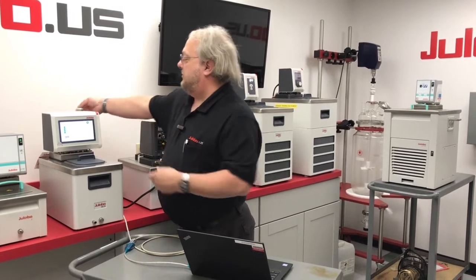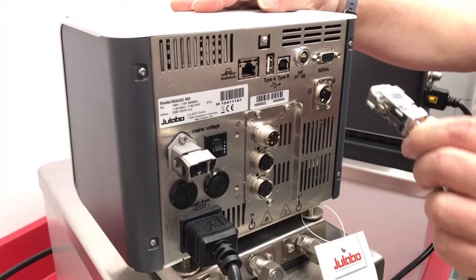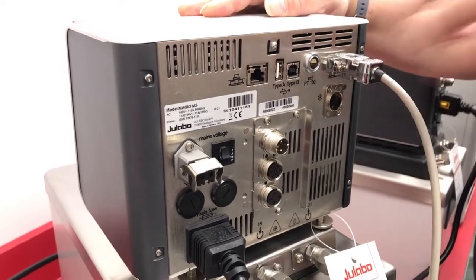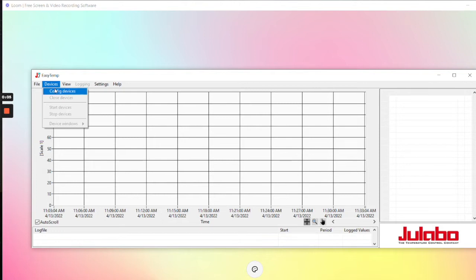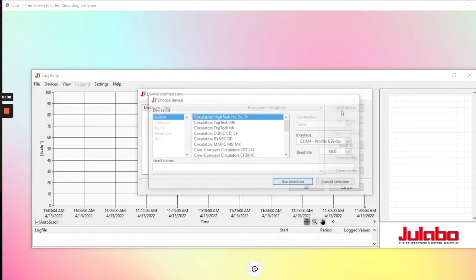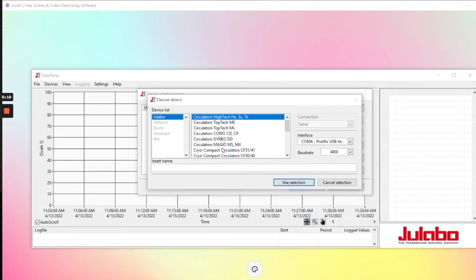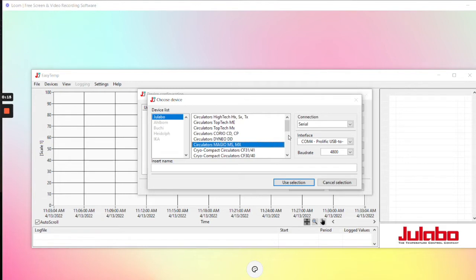Take the serial cable and plug it into the serial port on the rear of the unit. Open up your EZTemp program. Select your device, then Config Device. When you go to Add Device, select the model — in this case we're using a Maggio MS. It should show up as serial on your device window, and the COM should automatically be selected when you plug in the USB to serial converter.